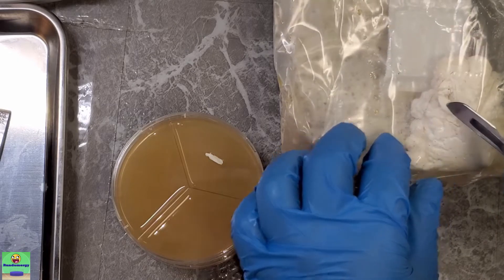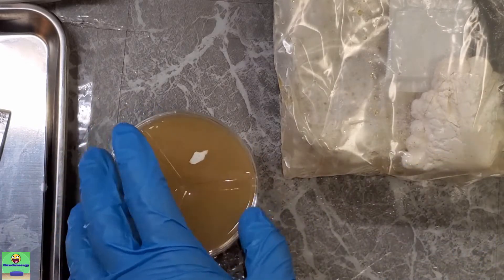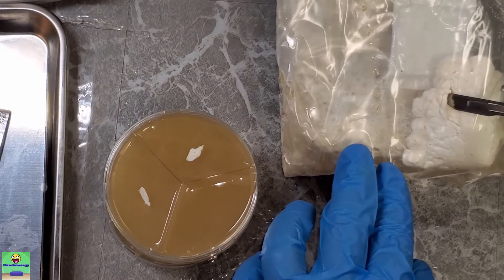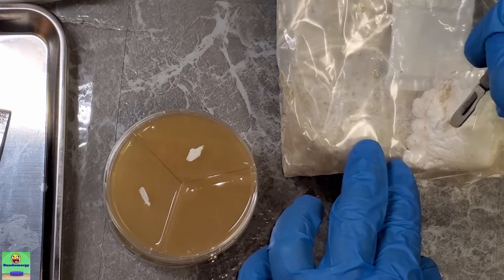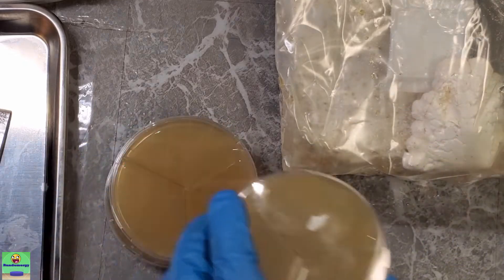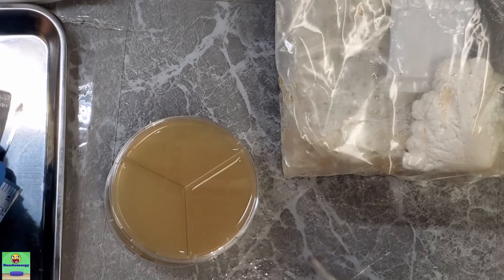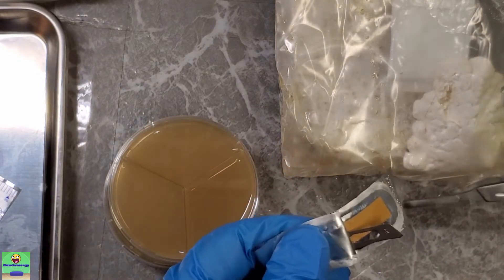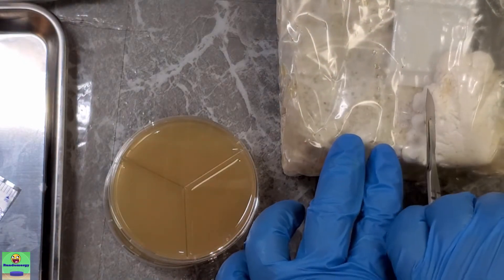Since I have three blades, I'll do three petri dishes — one blade per petri dish. Now I did swab down my entire counter with bleach before I started this and had it all sanitized. I had two air purifiers with HEPA filters running for about an hour out here, and I also UV sanitized the surface with these UV wands I have. To be completely honest I don't really know how effective those are — I got them at Walmart on sale for 50 cents — but we'll see.